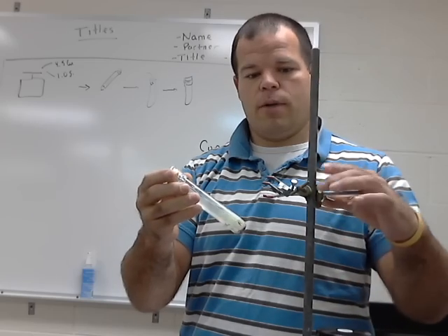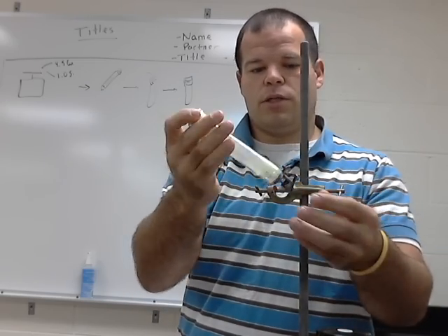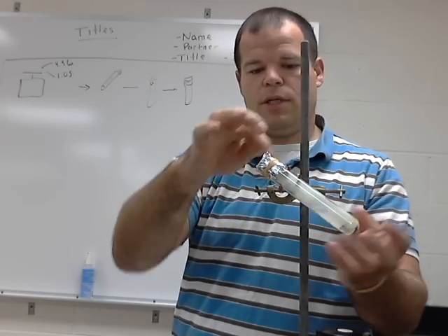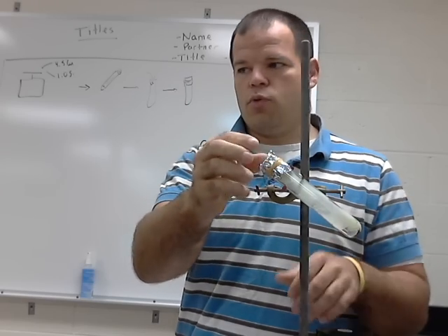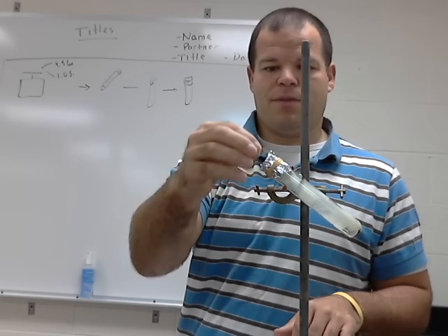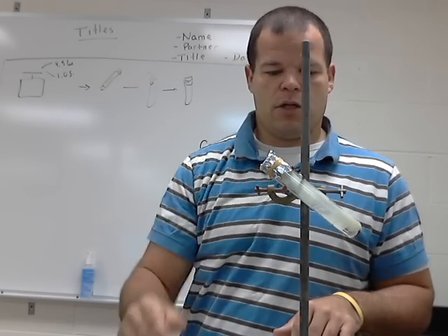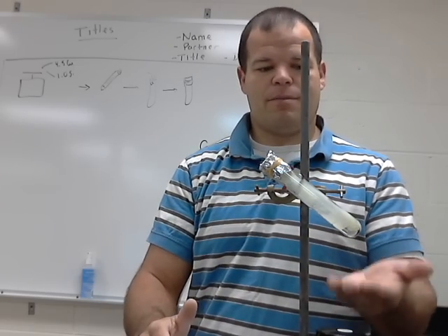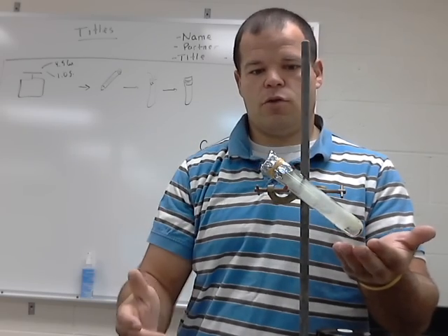A few things I want to mention here: this is a ring stand with a clamp on it, and when I put this in like so, secure it down, and you can play around with these various knobs to get what you want. Don't point the test tube towards anybody. If pressure builds up, this could pop off. It's not meant to be an air seal, just to keep things generally inside. If we heat this, I want the flame to come up here and not burn my fingers, the little rubberized fingers here, so be aware of that.